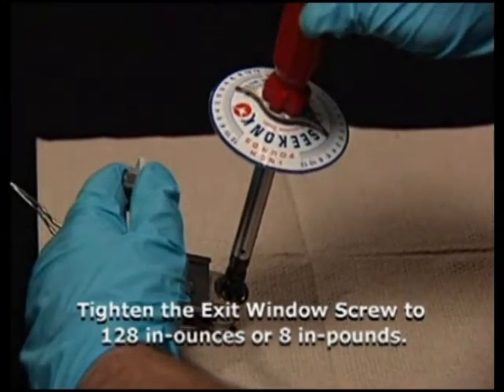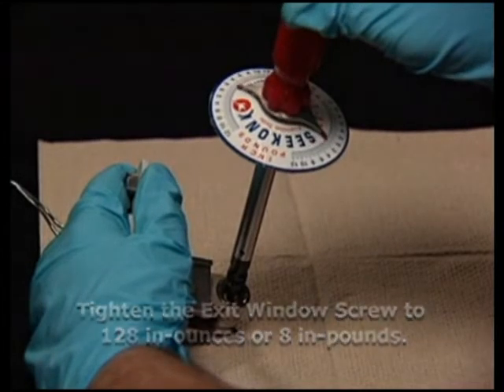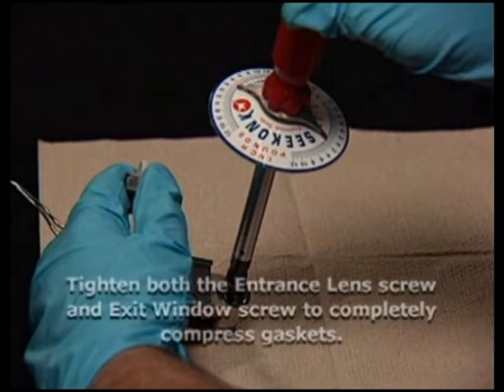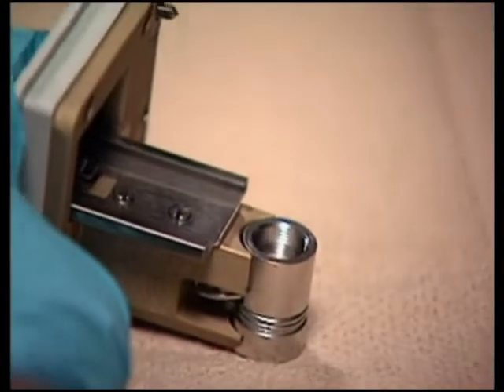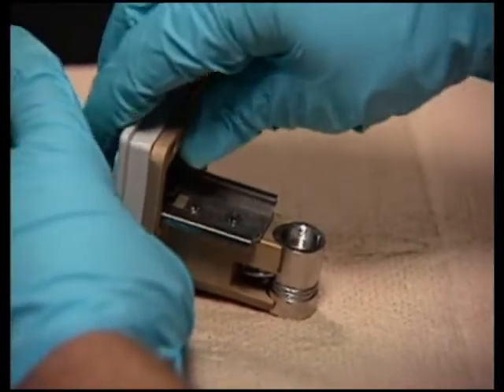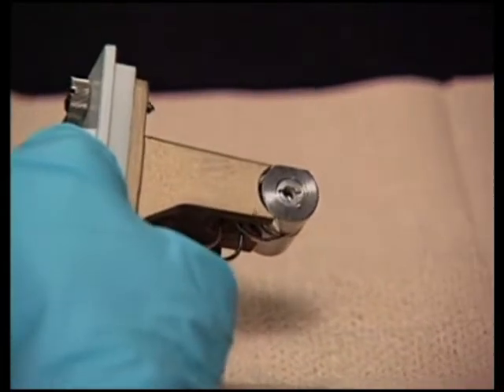Be careful not to over-tighten. Over-tightening will crack the exit window, while under-tightening will cause a leak. To ensure complete compression of the gaskets, both the entrance lens screw and exit window screw need to be tightened a second time. Flip the flow cell body over to the entrance lens side and tighten the entrance lens screw a second time to 128 inch ounces or 8 inch pounds.